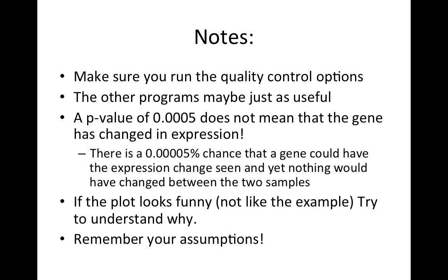Okay, so a couple of notes. Make sure that you run all the quality control options that are in the manual. I didn't go over them here just for brevity's sake, but it's really important to make sure you have quality data, or DESeq may not give you, it'll give you results, it just may not be the right results. The other programs I listed at the beginning may be just as useful. I only use DESeq because that was what I used when my data was available 2 years ago. I'm going to get some new data soon, and I'll probably be looking into several of those to see which one I think is most useful for my data.